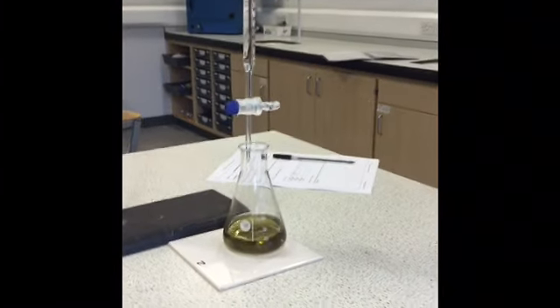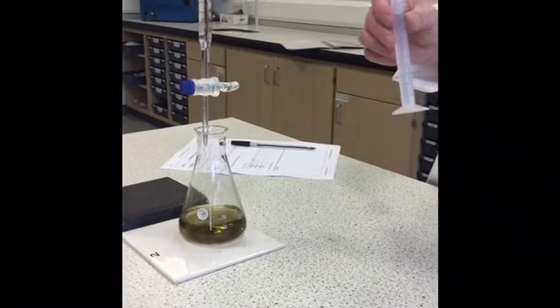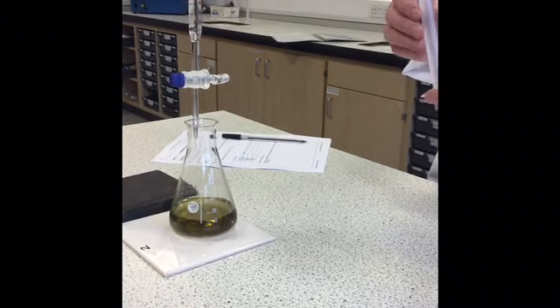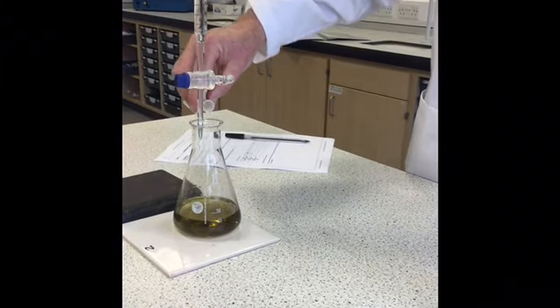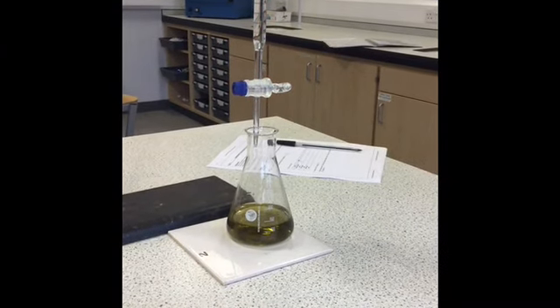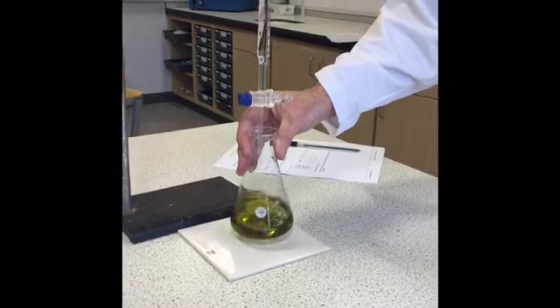We then add 10 cubic centimetres of ammonia just using the same measuring cylinder as you did for ammonium chloride. This is to make sure the solution is basic as the EDTA works best in a basic solution.